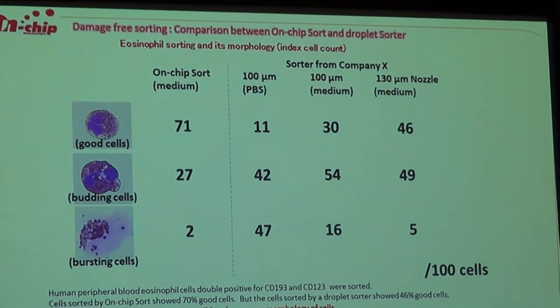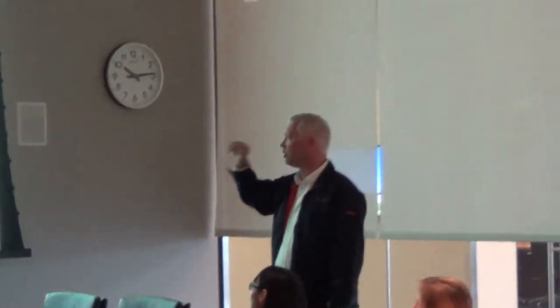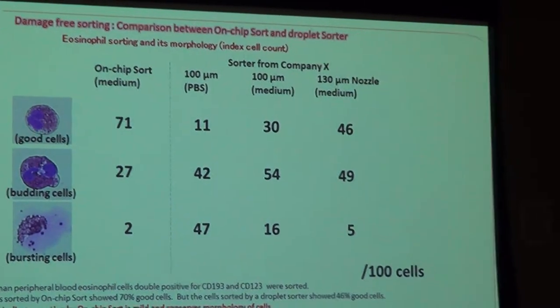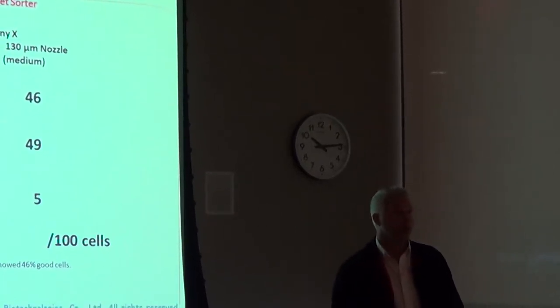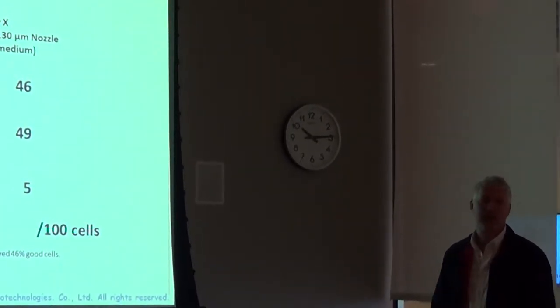And we came up with a little bit of a matrix because people were asking us to quantitate that. There are some groups, like Peter Lopez in New York, who are obsessed with what damage means in terms of stress proteins and situations. Basically, our first level of proof was looking at damage morphology from the picture side of things. We came up with a little quantitation on what we call budding cells and bursting cells, looking at raw data counts, at the most favorable nozzle settings, and also at the buffer media used for the sample and what effect that might have.